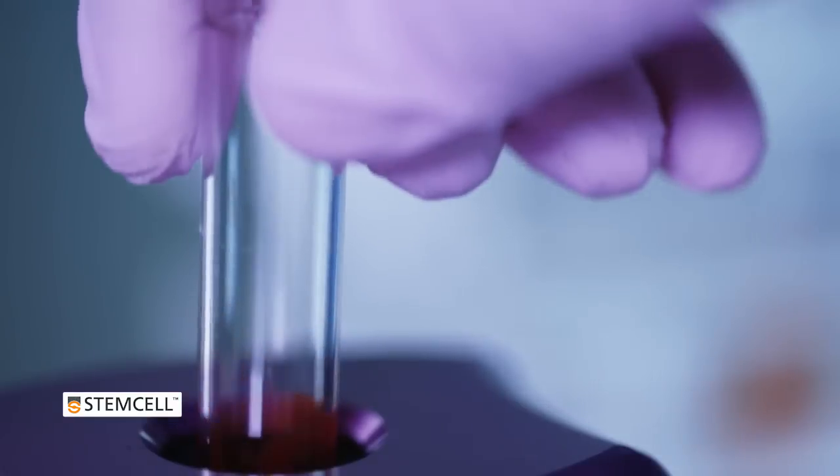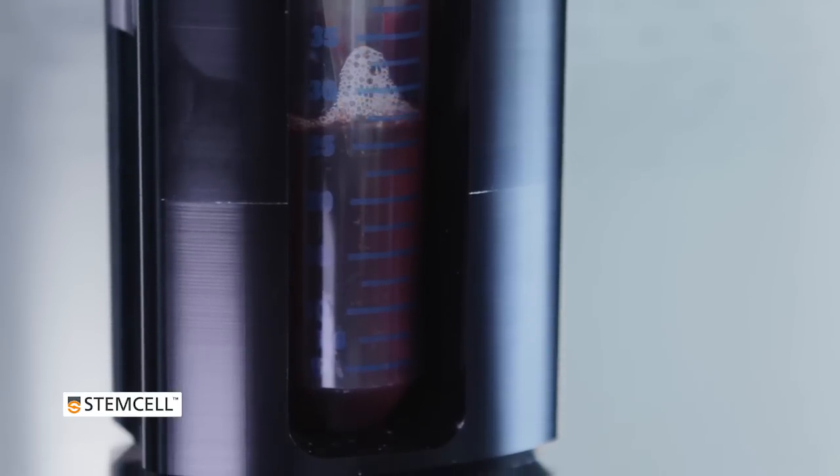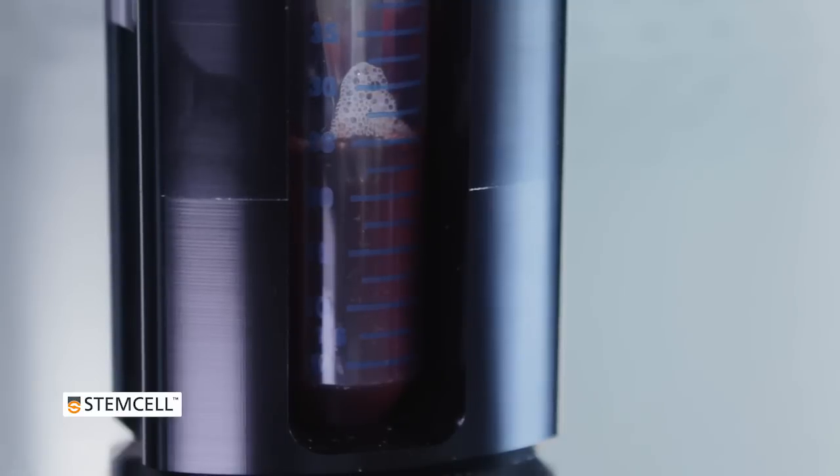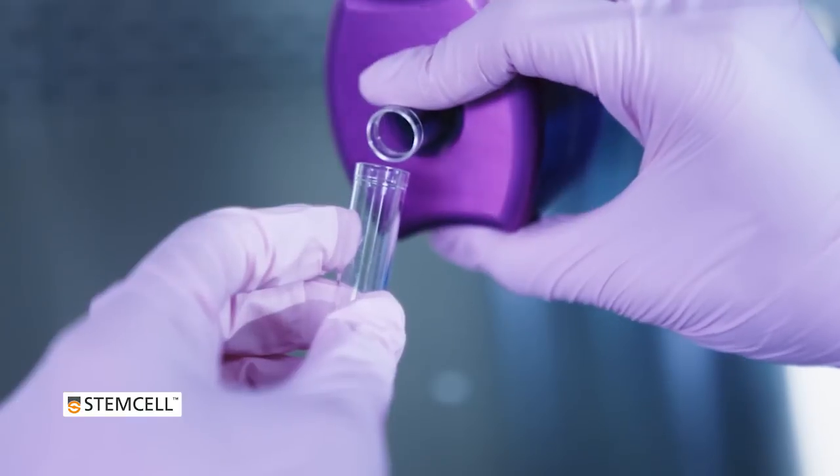Purifying cells from whole blood takes as little as 20 minutes from start to finish. Since RBC depletion and cell isolation are done at the same time, samples can be processed much more quickly and efficiently than with other techniques.